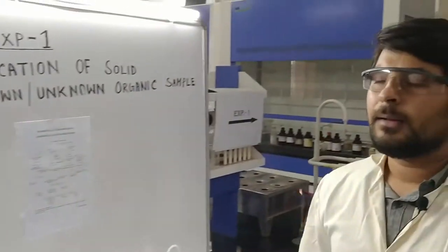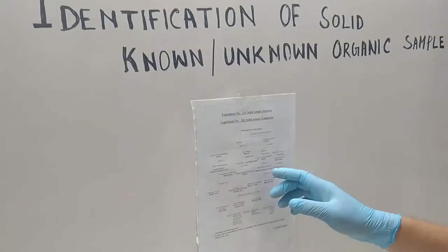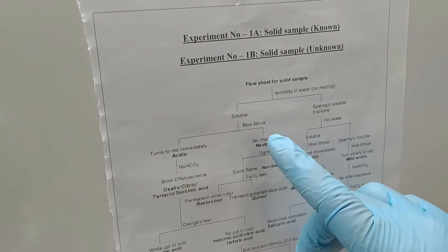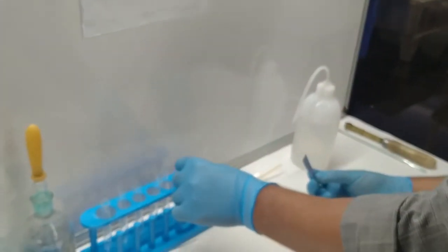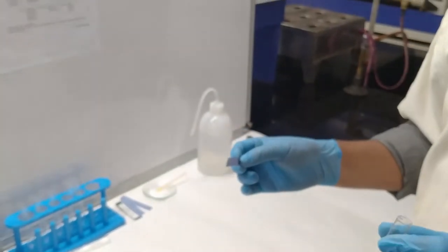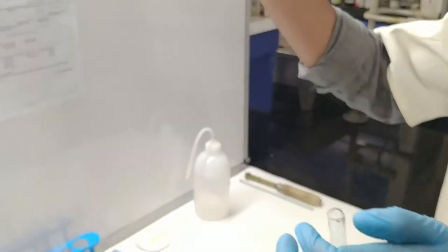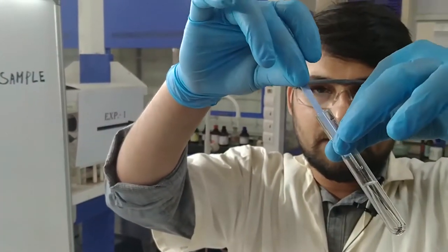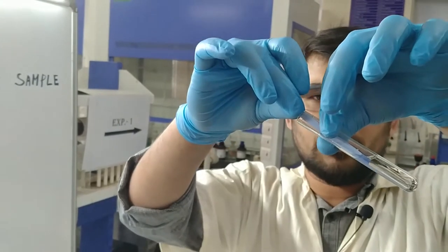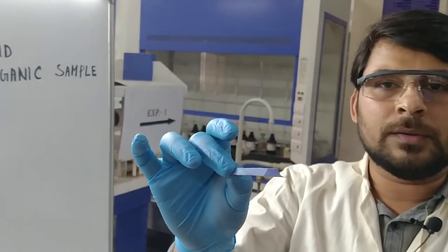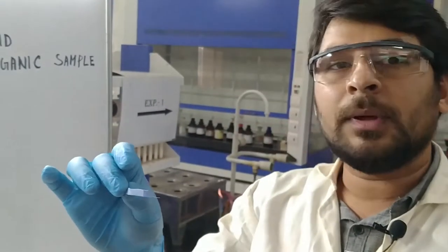The next test is the blue litmus test. I take a blue litmus paper and for this we also need an aqueous solution of glucose, but I already prepared this in the first test so no need to prepare again. I just fold the paper and place it in the solution. You can see no changes in the paper, so that means this solution is a neutral solution. Our blue litmus test is over.